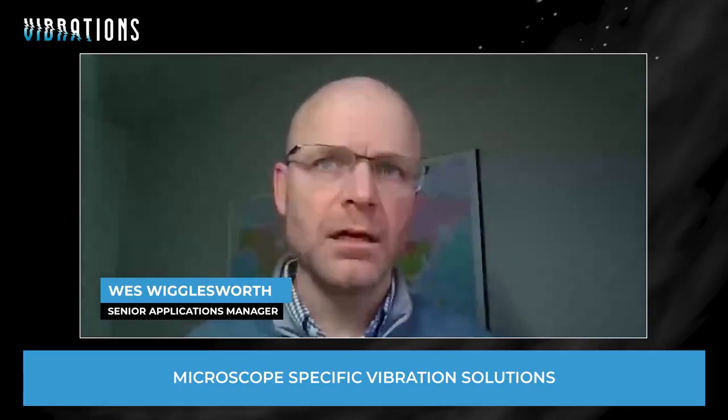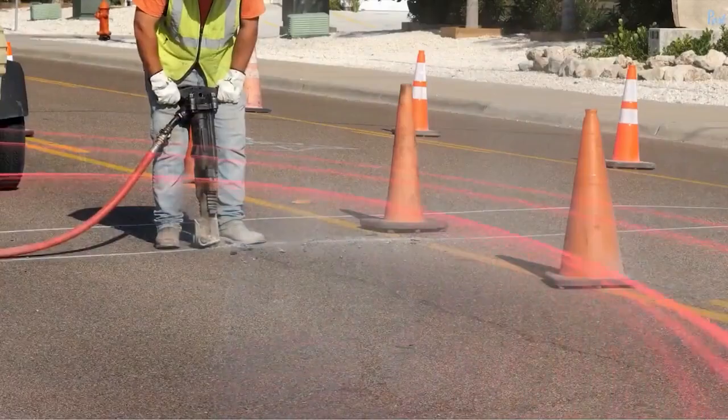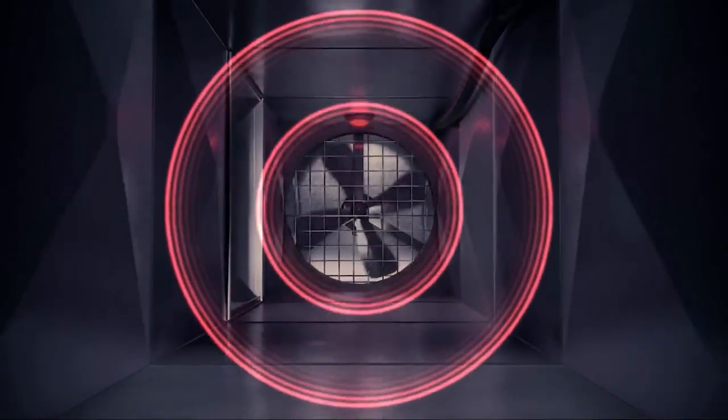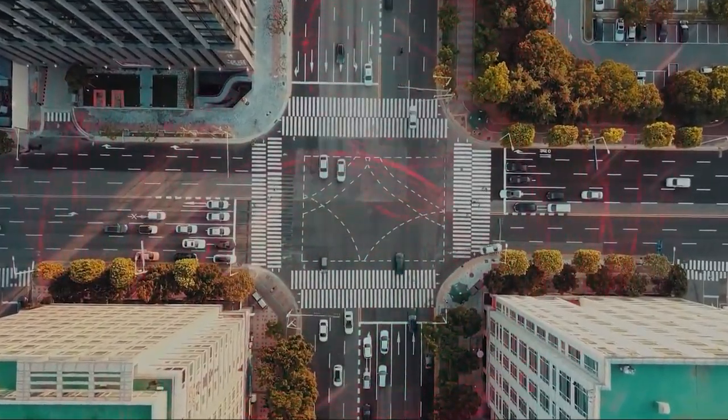Vibration comes in many forms. I mean, there's periodic or coherent vibration that might be coming from a fan or an HVAC system. And then there's what's very common everywhere, just random, incoherent noise, every floor. So understanding how to measure and see the different types of vibration in the data is really important.